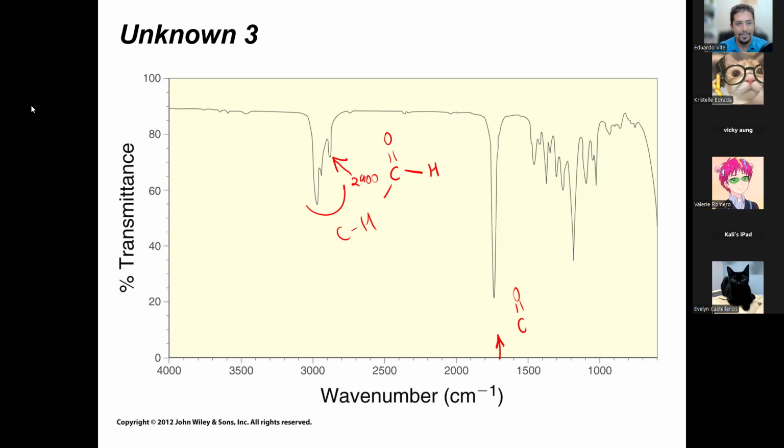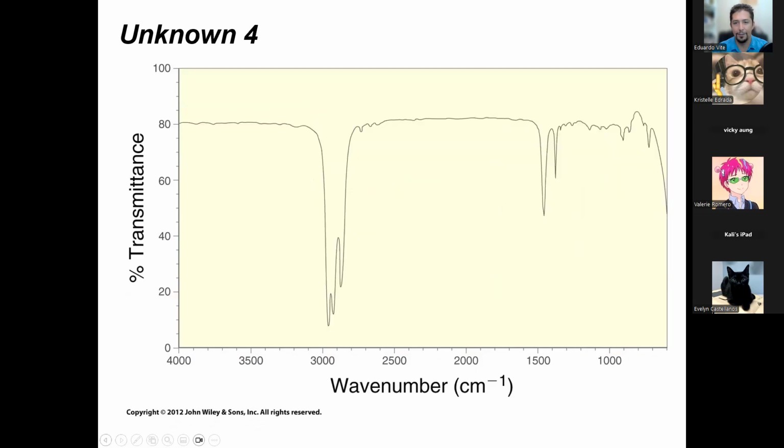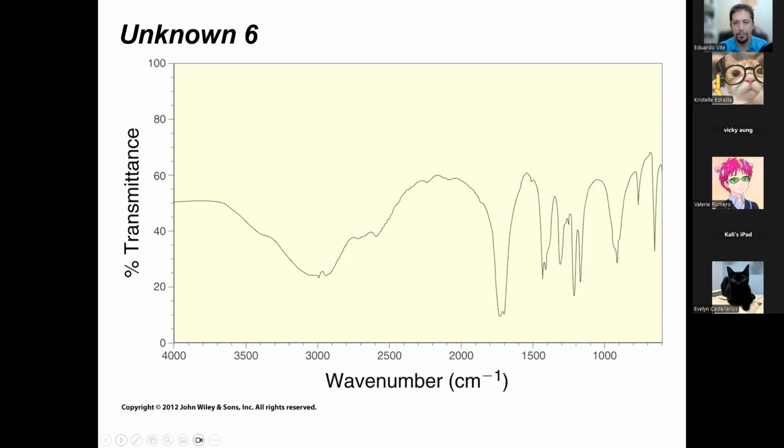All right. So let's see. We have about a few more examples, but I'm going to have to unfortunately skip them for the sake of time. We know that's an NH2 right there. You see that? We know this one is an alkane just because there's nothing else here. So that's just boring old alkane. This is an NH2. Nothing else can be determined. This would be a carboxylic acid because you have that really broad signal, kind of looks like a distorted beard. You have a peak at 1700, not exactly the way it normally looks, but it's at 1700. It's very strong. And you have an OH carboxylic acid signal. So this whole thing is a carboxylic acid.